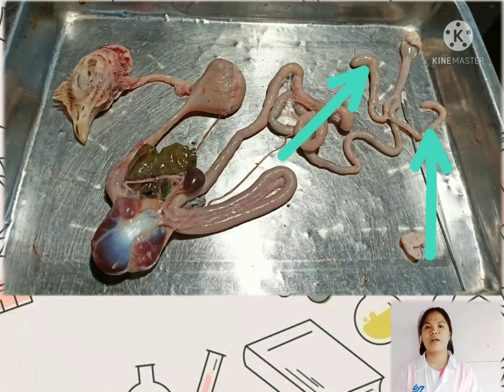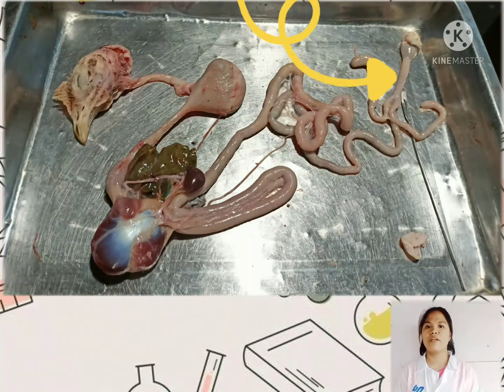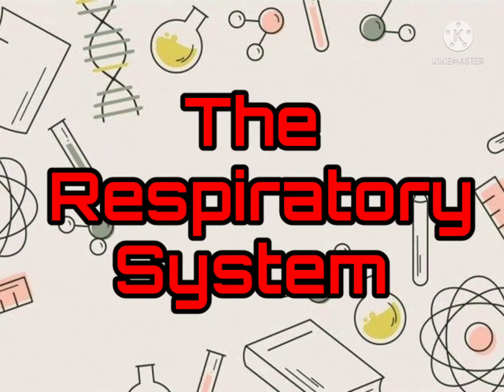The ceca is where bacterial action helps break down undigested food passing through the intestine. The ceca turns into the large intestine, which connects with the cloaca. The large intestine functions primarily to absorb water, dry out indigestible food, and eliminate waste products. And then the next one is the cloaca, where the digestive system, urinary system, and reproductive system meet. And the last one is the vent, the external opening of the cloaca that passes waste to the outside.